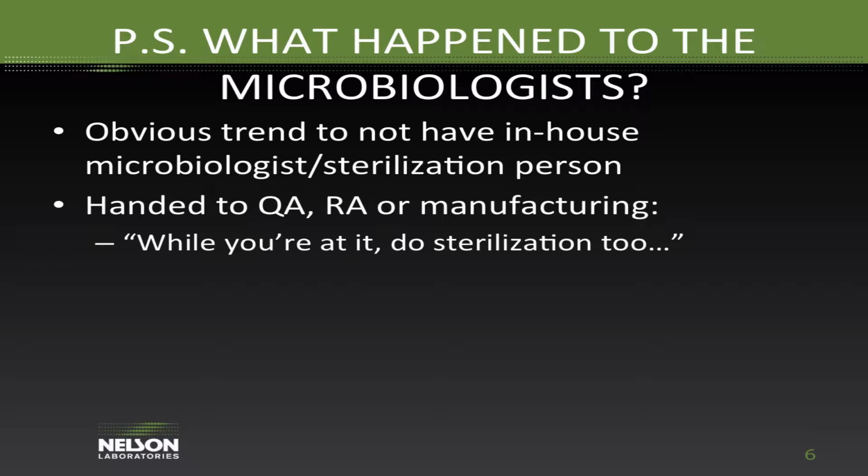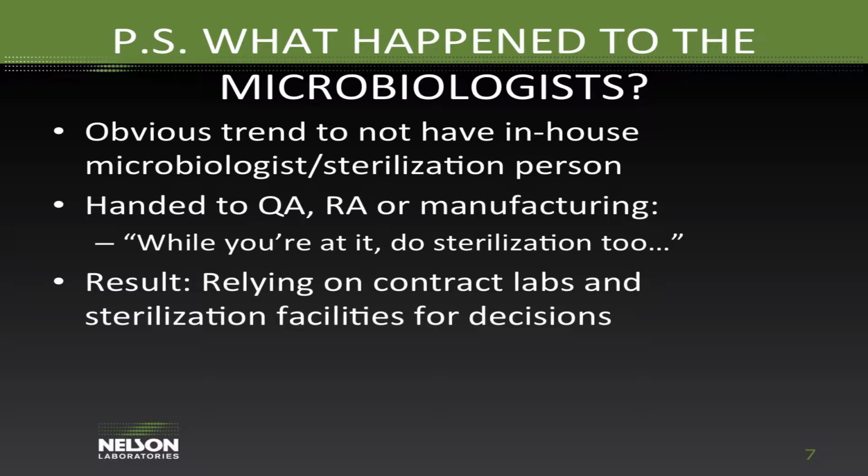Now, oftentimes, microbiology and sterilization is given away to someone else. They say, well, while you're at it, you're in QA, so why don't you do microbiology and sterilization? Or you're in RA, or you're in manufacturing, why don't you also handle microbiology and sterilization? And the result is that many medical device companies are then relying heavily on contract laboratories and contract sterilization facilities to provide guidance on how they should do microbiology and sterilization.